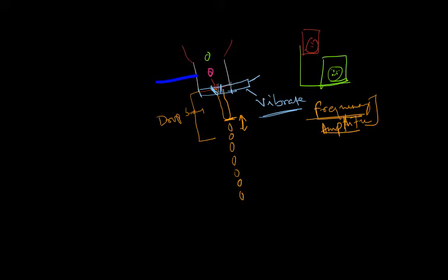So by having a desired breakpoint, what is the advantage? Here, as the cell is getting illuminated and then it moves. But as long as the stream is continuous, the cell is still in connection with the system. So the cell moves in the system like this.